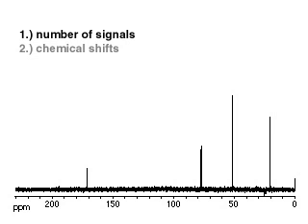This spectrum shows 5 signals. The triplet at 77 parts per million is caused by an NMR solvent, deuterochloroform. The signal at 0 parts per million belongs to the carbons of TMS, the internal standard.